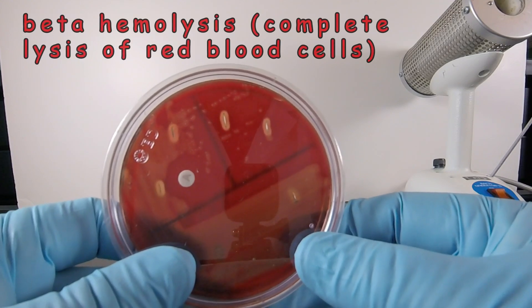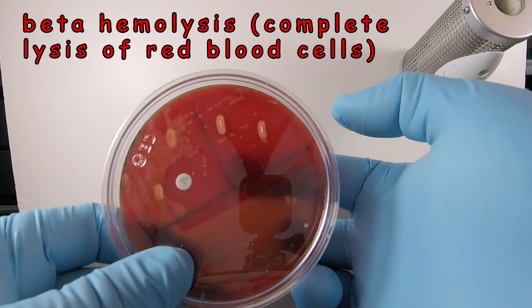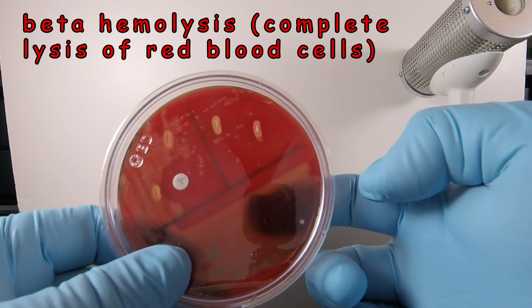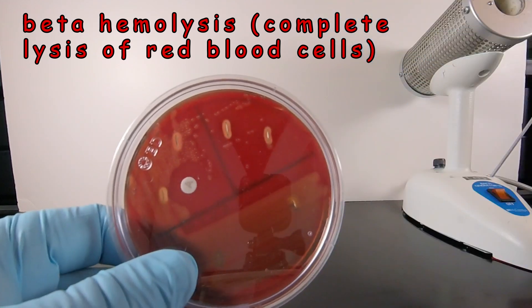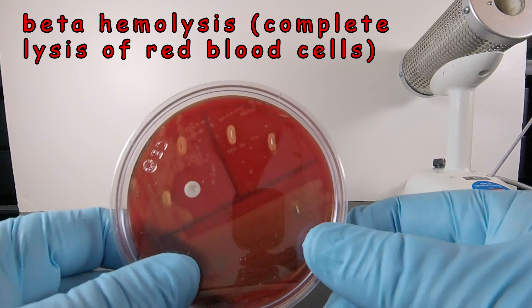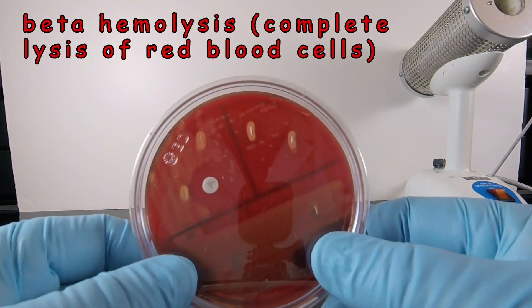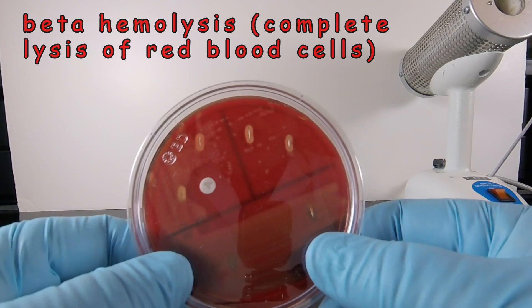We see beta-hemolysis. You can see the beta-hemolysis around the individual colonies, around the solid growth, but especially where the agar was stabbed, where both the hemolysins are functioning and lysing the red blood cells. This is a complete lysis of the red blood cells in the agar, which we call beta-hemolysis.